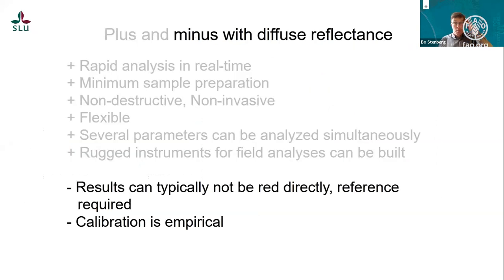So there are some drawbacks also. Before I mention the positive things with NIR, I think I did. I don't remember now, but yes, I did. But the drawback is, as I mentioned, that the spectra are quite messy or complex or hard. You can't read a peak height or a peak area to directly read the content of clay or organic matter or something else from that.